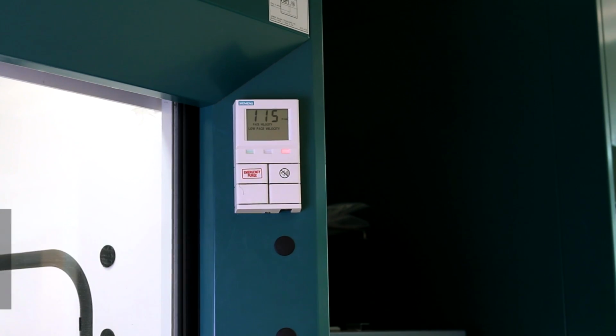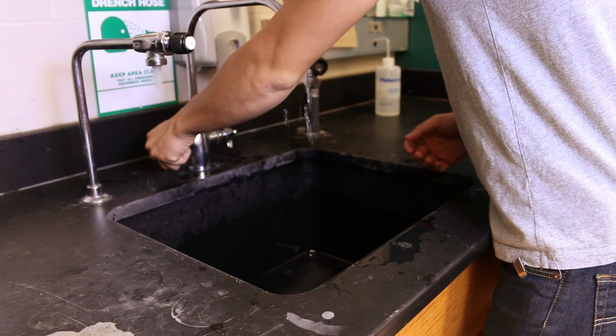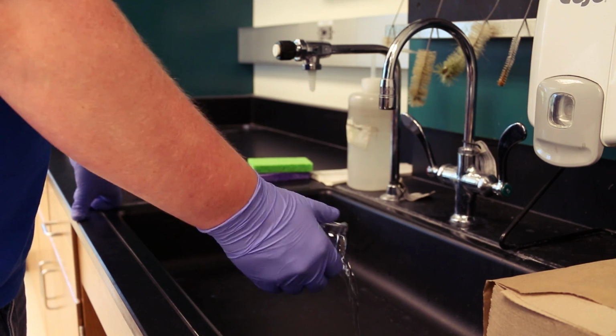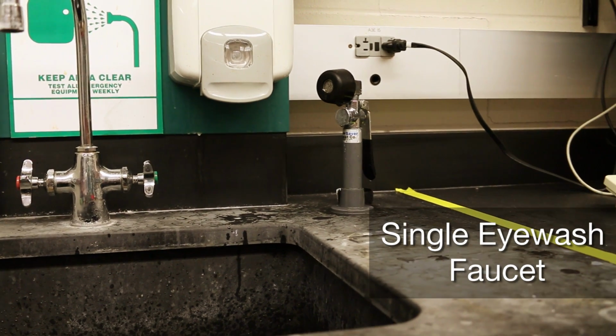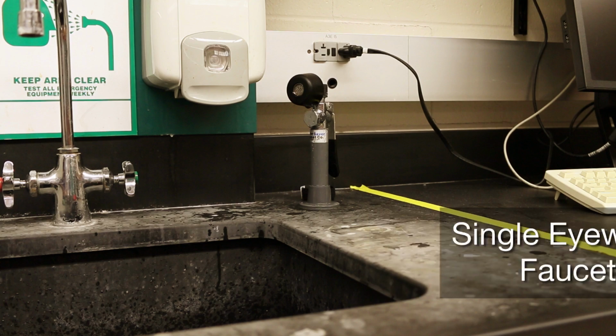Another common space in the lab are the large lab sinks. Wash your hands during the lab as needed, and always before you leave the lab. Do not put solid chemicals down the drain. Chemicals approved for the waste stream can go down the drain, flushed with tap water. Some of our large sinks have single eyewash faucets on the side of the main faucet. We will talk about those in a later section.